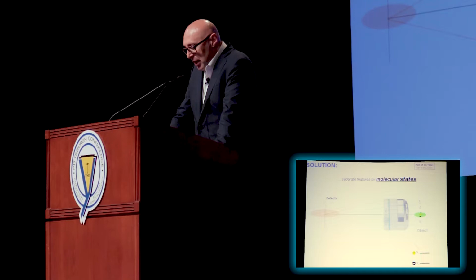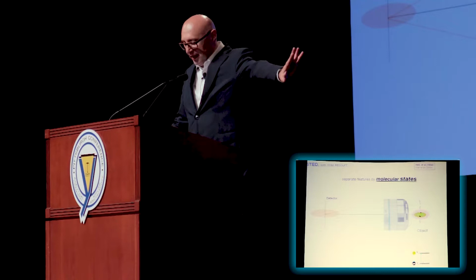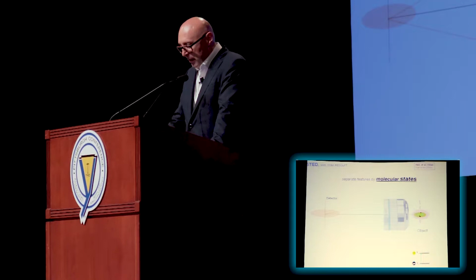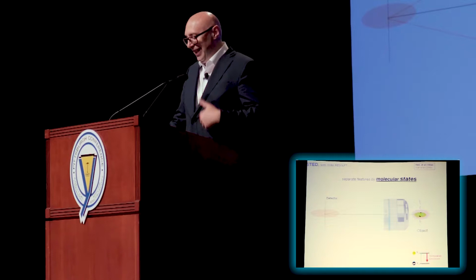And so this has been the basic idea of STED microscopy, and this is how STED microscopy set itself apart from any other super-resolution concept that existed before. It played on and off with the dye in order to make the dyes distinguishable within that green diffracted spot of light. Now, stimulated emission, as you may know, just pushes a molecule from the excited fluorescent state back down to the ground state, and in this way, we can keep the molecules dark.